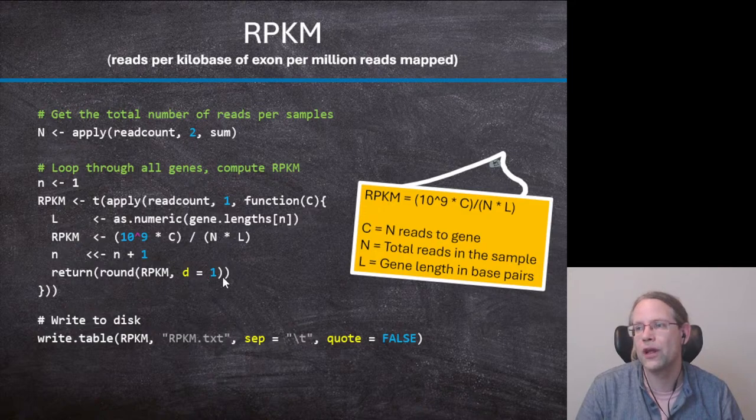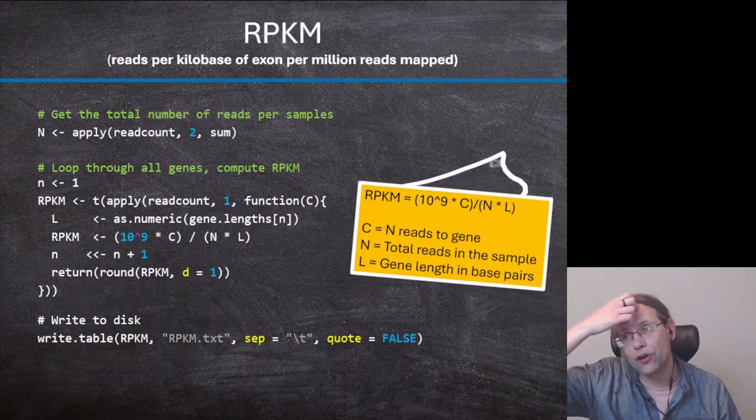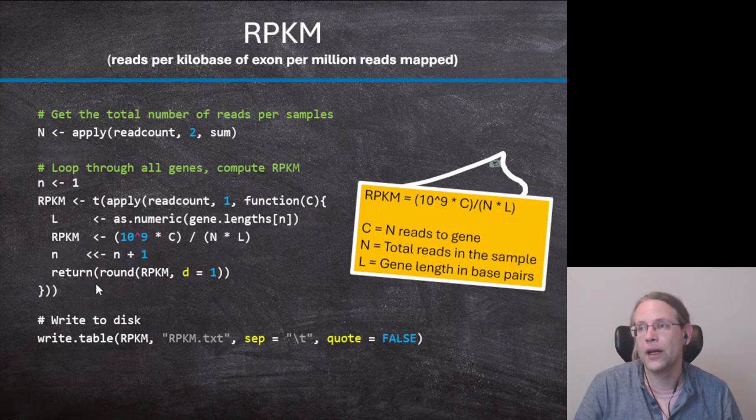So I'm just going to round them down here so that I get read counts, which are 100.5. The original number used to be in the order of like 100 or 200 or 300 before it was scaled. But of course, I don't get 8-digit precision behind the comma from it. So that's why I'm rounding it down. So this is how you compute RPKM values, right?